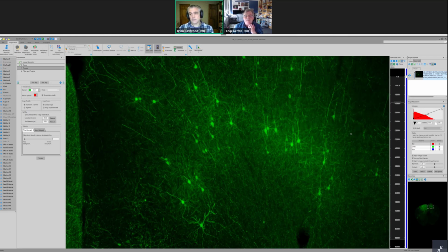The way I always think of it is that this is like a topographic map of a mountain range. The things that are very bright have very high intensity levels relative to their surrounding area, and that's what this program picks out.